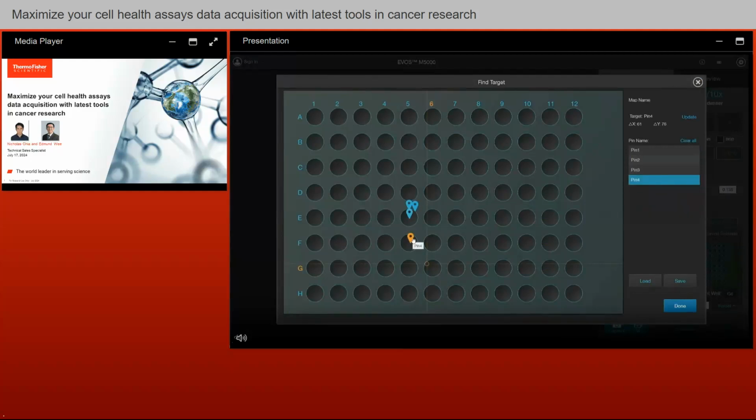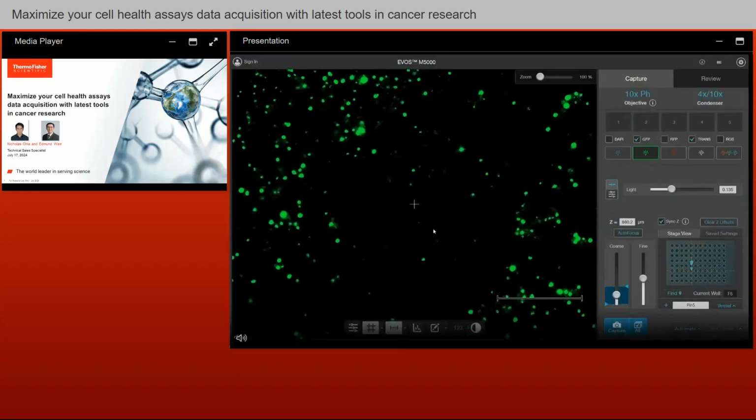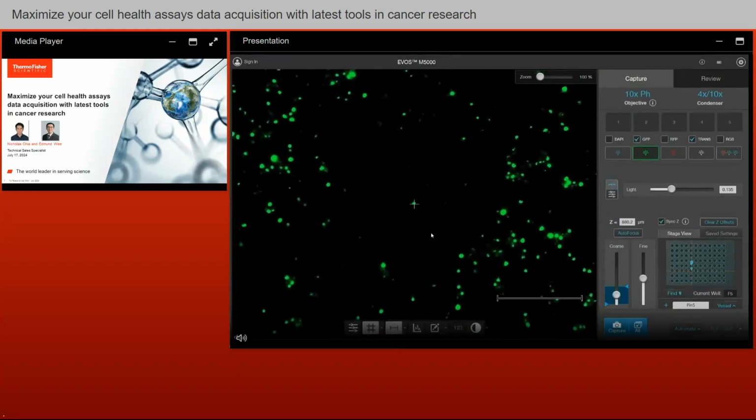So now pin 4, I'll move the stage back. Let's get close to the pin. And once we are near it, see it turns green again. So let's check the cell. Yeah, this is the one. Let me just place the cursor on it.